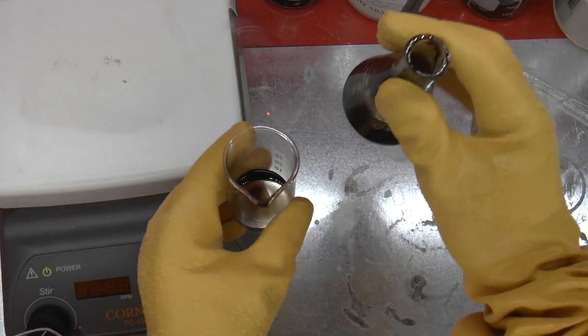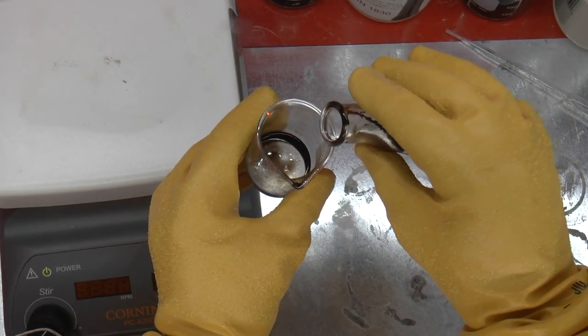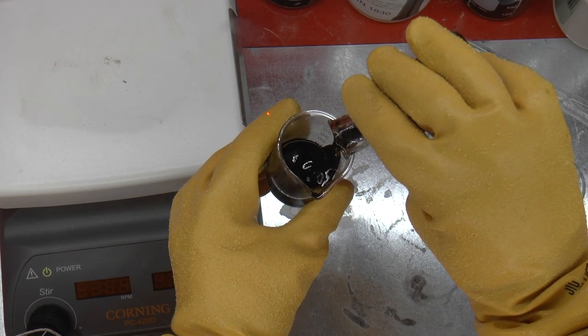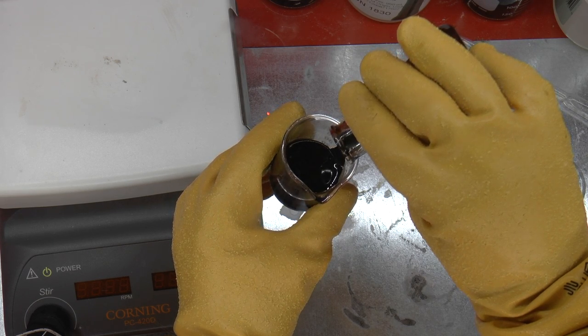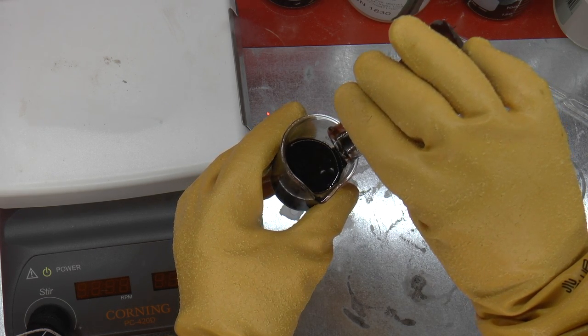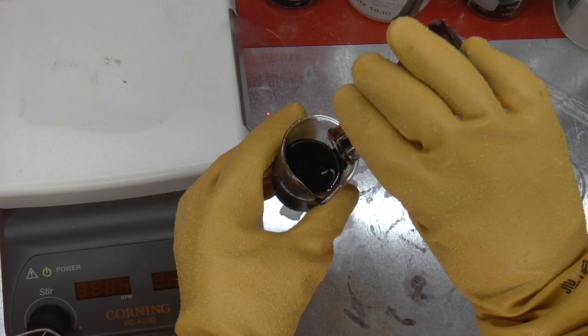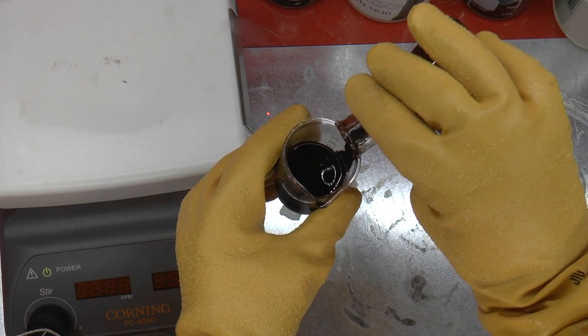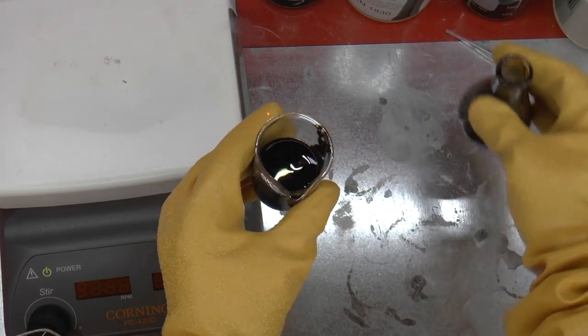Here's my beaker and here is my flask. So again, pouring it out slowly. This time I'm pretty sure that I have the dissolved chip in the flask.